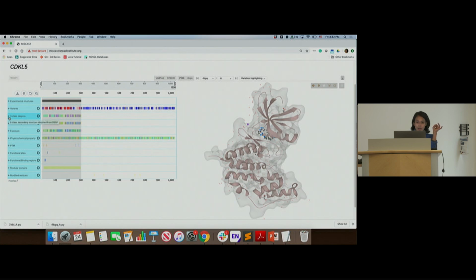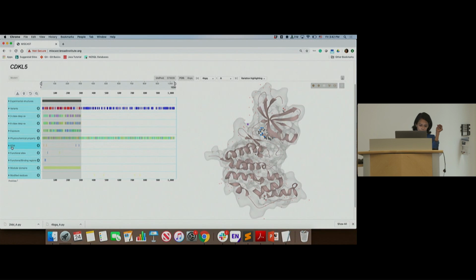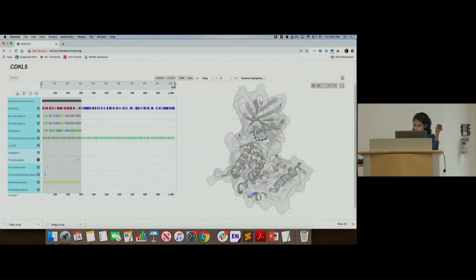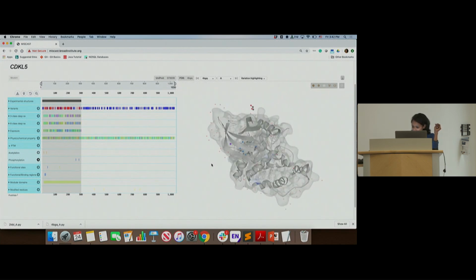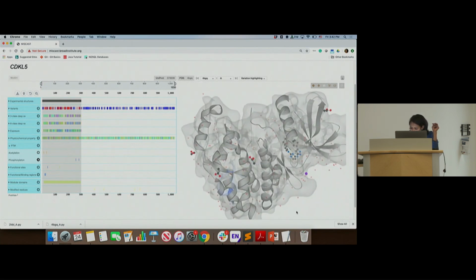And then you can expand this 3-class DSSP-SS, and now you can specifically explore the beta sheets. Now you highlight a specific type, right? And then again, if you click back on this arrow, that selection will be gone. So now, as AJ was showing, we can highlight the phosphorylation sites. One is coming up here, and another is on the other side, right there, here.